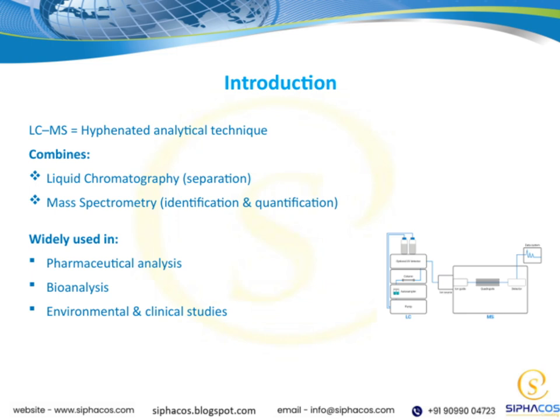You'll find LC-MS widely used across various fields. In pharmaceutical analysis, it helps in drug development and quality control. In bioanalysis, it's essential for studying biological samples like blood or tissues. It's also heavily relied upon in environmental and clinical studies, where detecting trace levels of chemicals or biomarkers is critical.